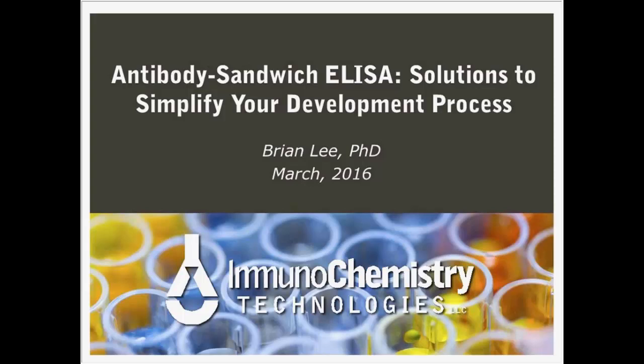The ELISA as an assay is typically considered to be specific, low-tech, sensitive, and quantitative. In many cases, it is the go-to method because of this for assessment of various scientific, biologically significant, commercial, environmental analyte targets in plasma, serum, environmental samples, whatever. And so that's the basis for this brief webinar today.